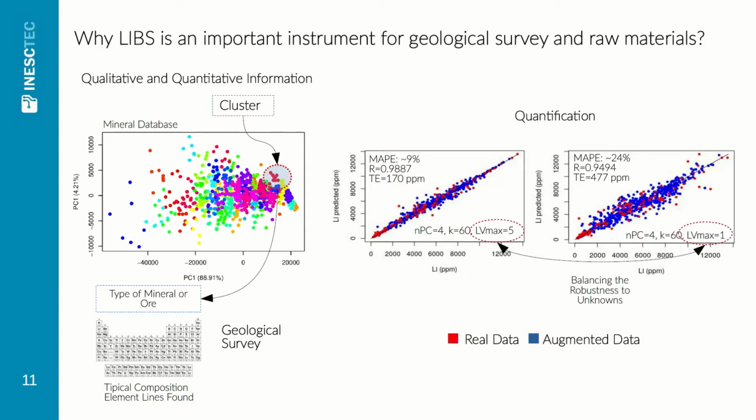You can see that with some methods that we developed, we get quite good accuracy in quantifying the lithium without a lot of sample preparation.